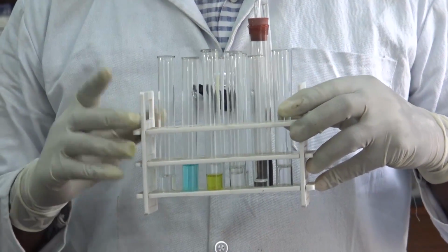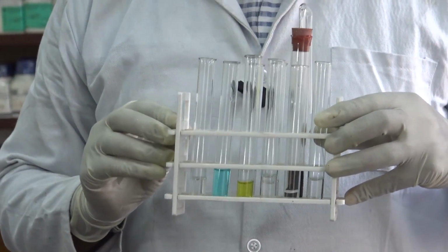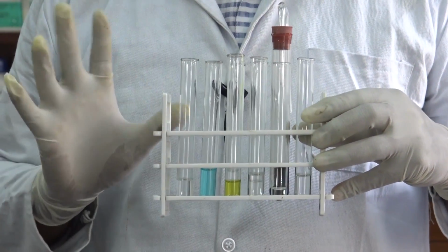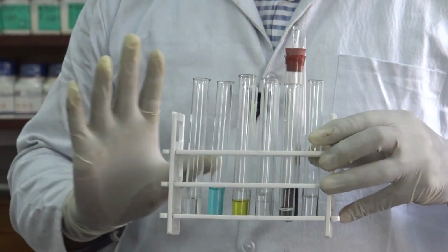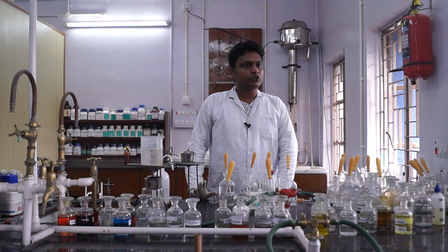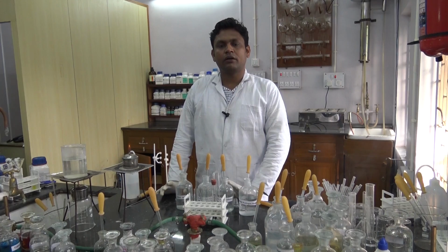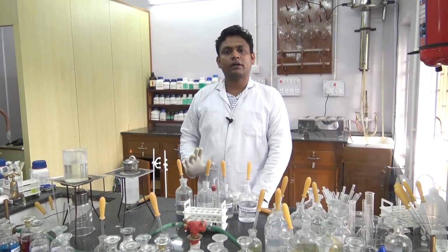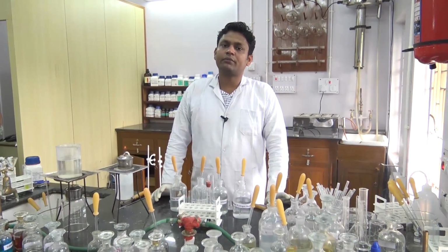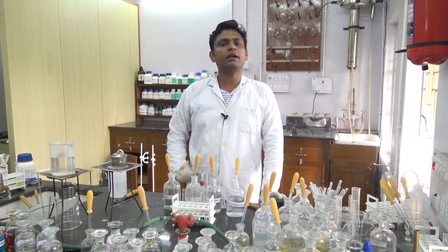Now we have prepared 6 test solutions, taking one known sample of each group, which I will show using the group reagents. How the group reagent is treated with this solution I will show in the next session. First of all, I have taken only one test solution. For different samples, the color of the precipitate may change depending upon the sample characteristics, but here I am showing only one sample.